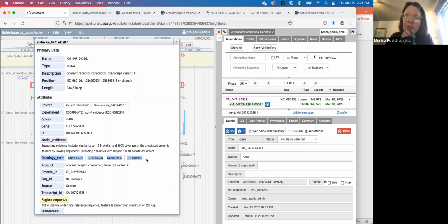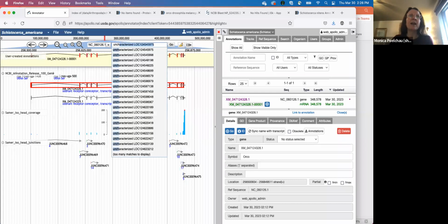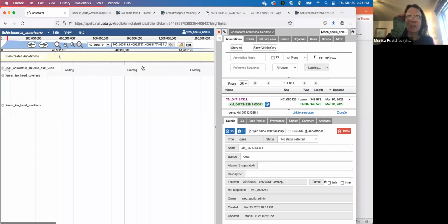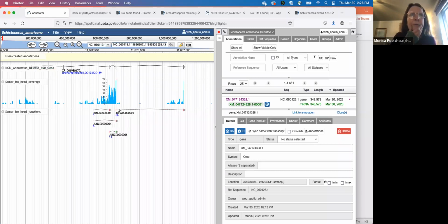So if your protein had similarity based on the annotation pipeline that is referenced in the page that I showed you earlier, then this will show up on the browser page for that as well. I just searched for some uncharacterized ones here, and there were no gene ontology annotations for that. And this is an XR too, so it's not a protein, and so by definition, it won't have any. Yeah, these are all XRs. So not all of the proteins will have a gene ontology annotation, and sometimes it will be uninformative too, if it's protein binding, like, yay.